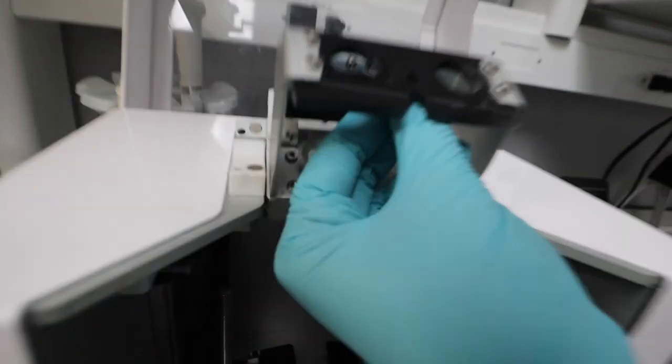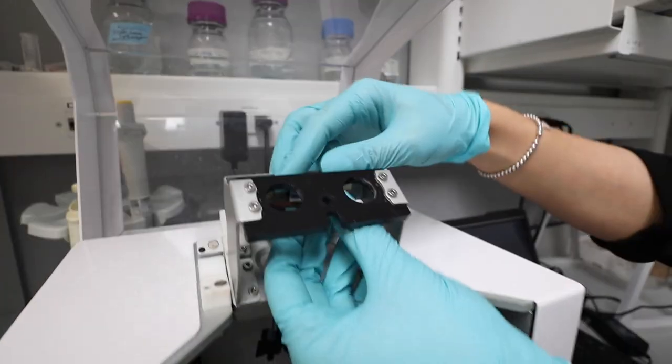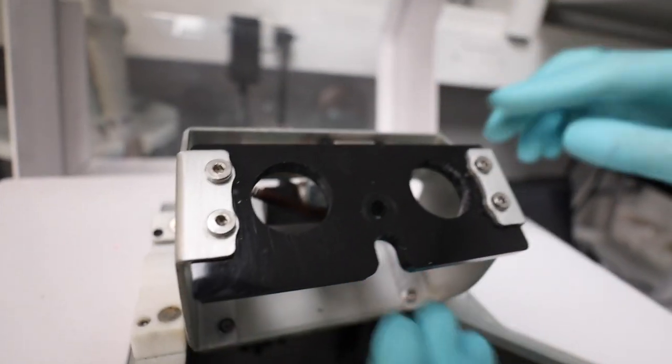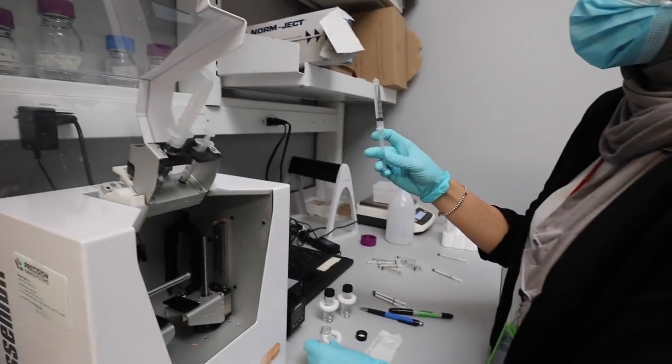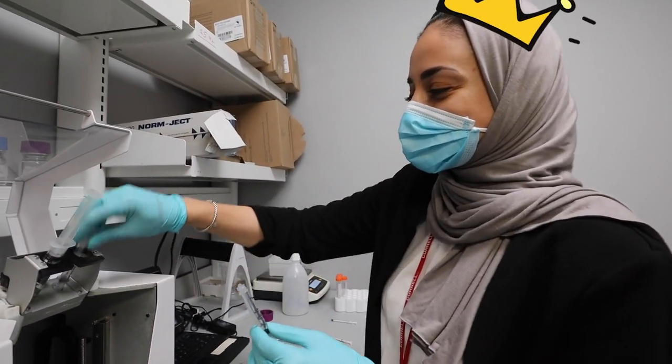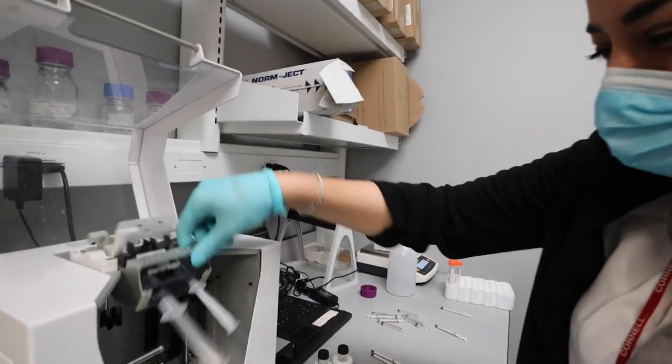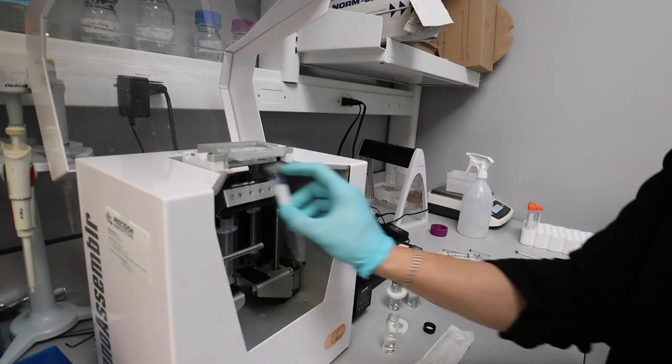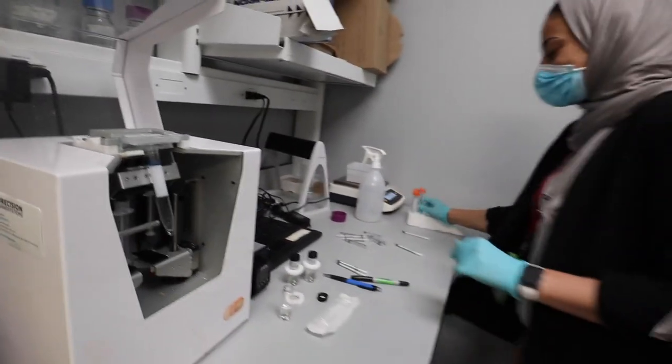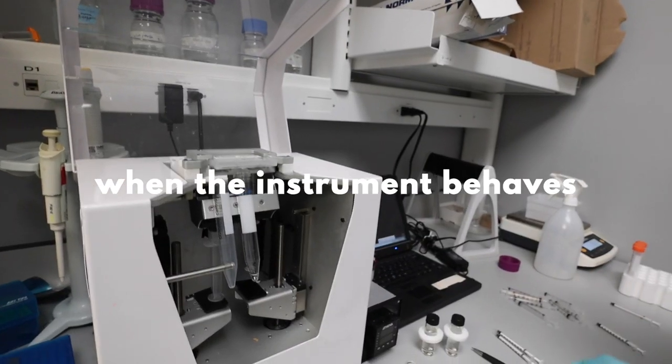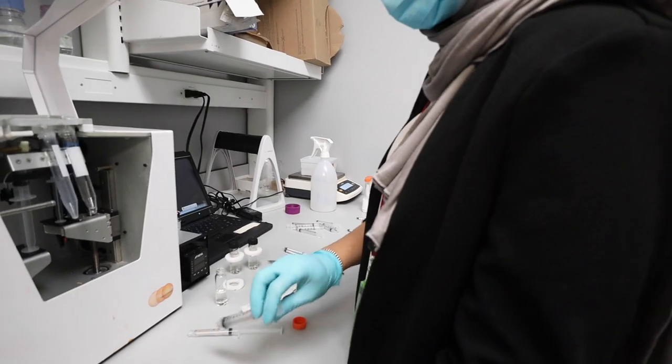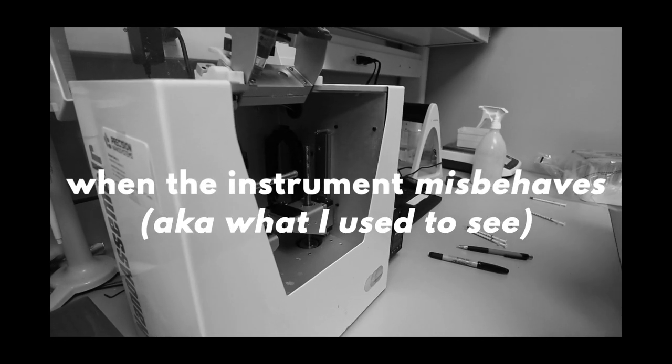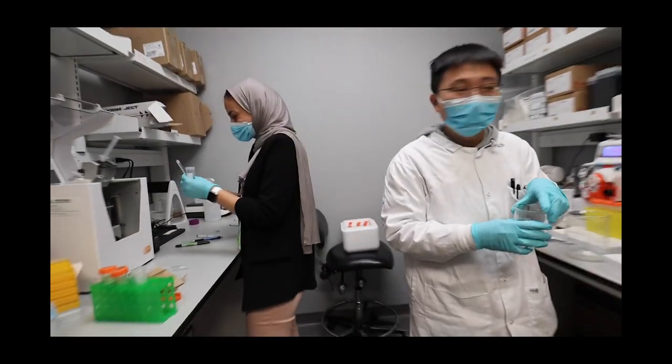In my lab tour video I said I don't use this because it's on the verge of breaking. It is on the verge of breaking. Noju's super glued this. This springy thingy is so bad, right? This one's the buffer, this one is the lipid mixture. She looks so professional when she does that.